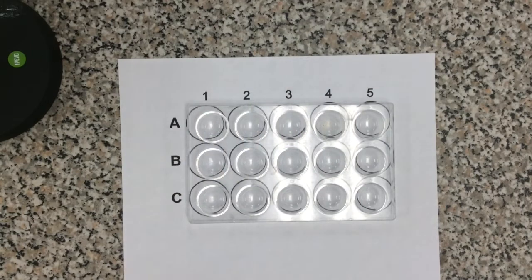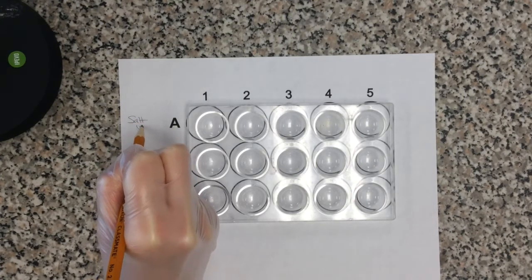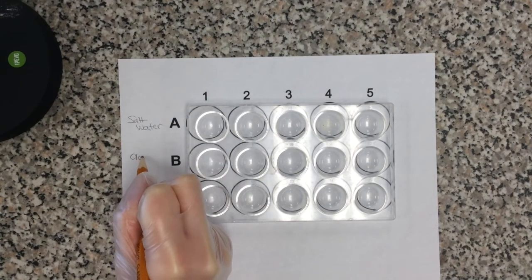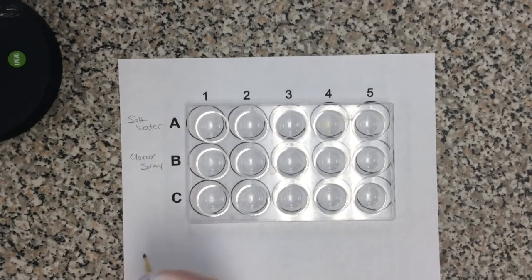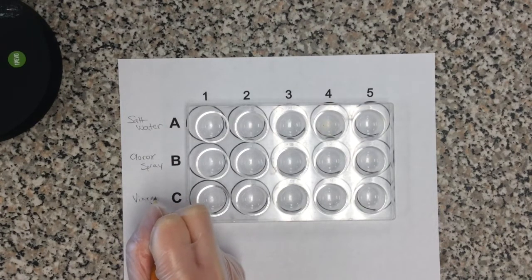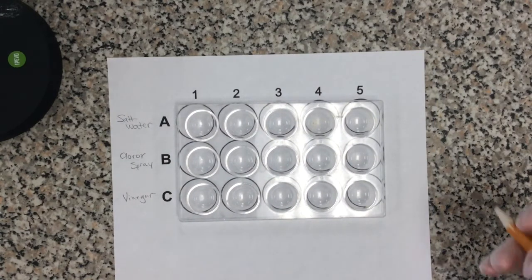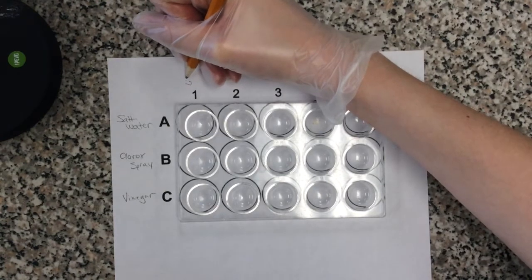Okay, so now we are going to be doing our three other samples, which are salt water, Clorox spray, and vinegar. All right, make your predictions now, folks. All right, and this time I'll make sure I do it in the order that it is on your chart.